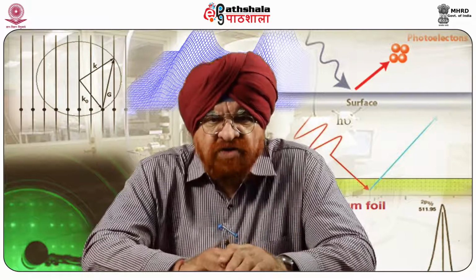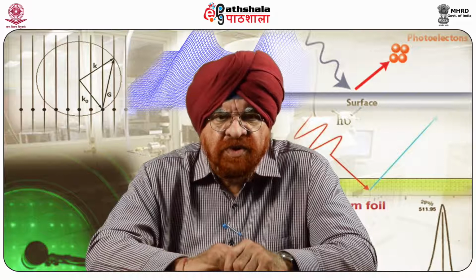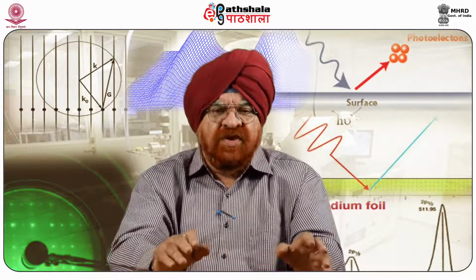Compared with scanning electron microscope, SEM, the AFM provides extraordinary topographic contrast, direct height measurements, and unobscured view of the surface features. No coating is necessary while using this.